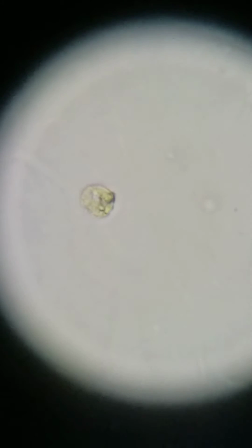And mucus. And that I can't really focus on either. It could be a transitional. So we're going to go with less than 1 transitional, less than 1 white, less than 1 renal.